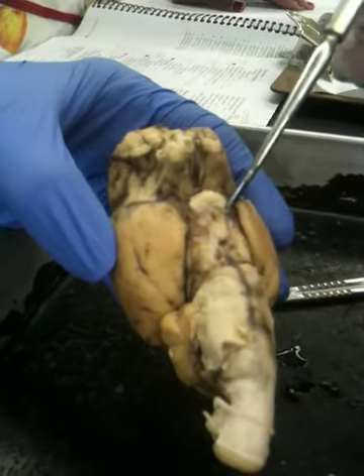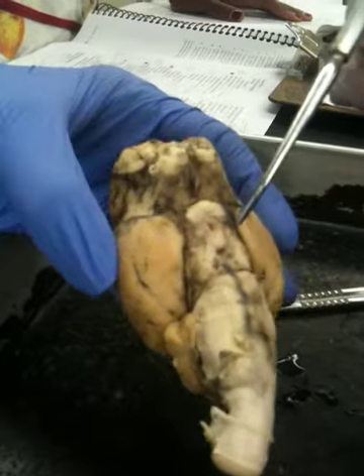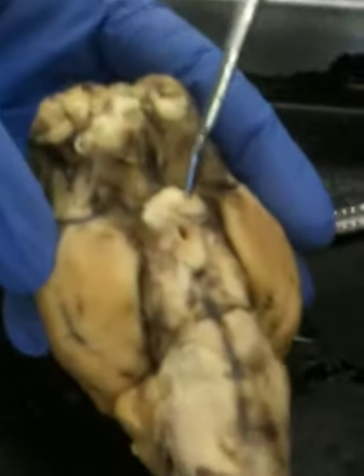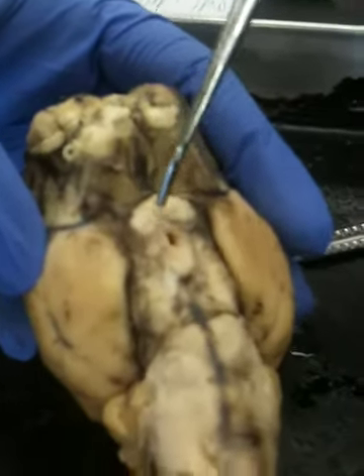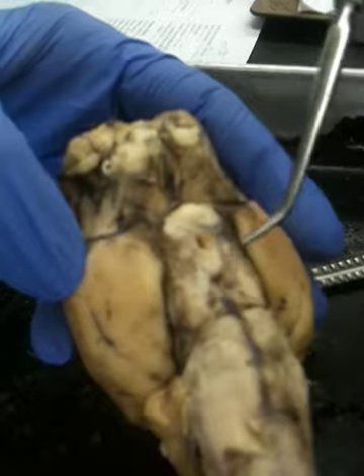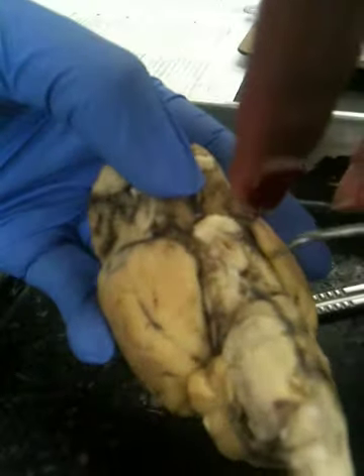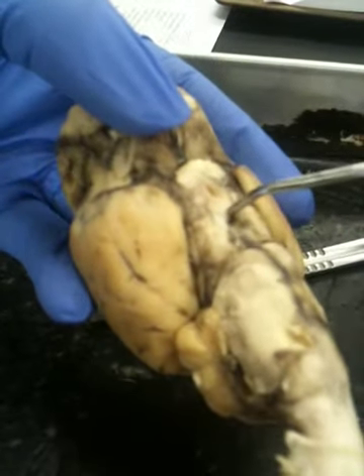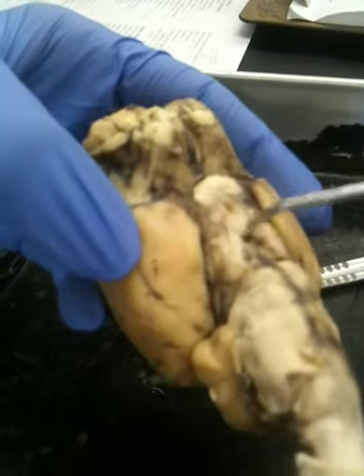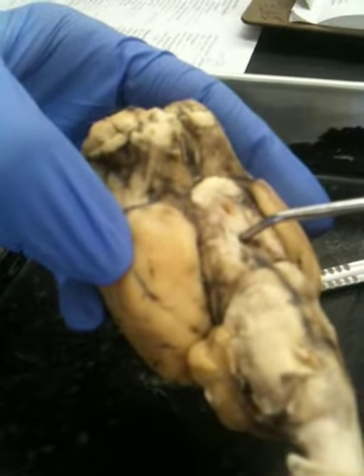The mammillary bodies, can we see them on here? Yeah, it's just this big lumpy thing. It's actually one body on the sheep's brain. Where? Oh yeah, I think it's a small one right below the hole. Mammillary body right there. This is where we feel our emotions from our sense of smell.